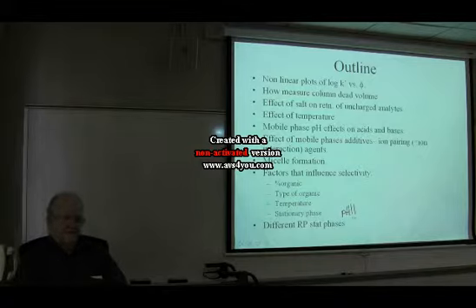The other factor is the following. The organic modifier has a rather big effect on the viscosity of the solvent. In fact, if you start with pure water and you add some organic solvent, generally the viscosity goes up, goes through a maximum, and comes back down.